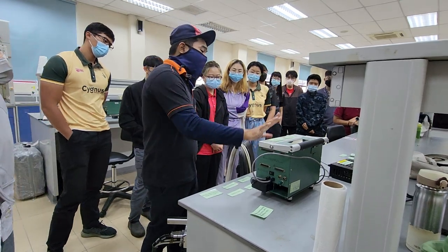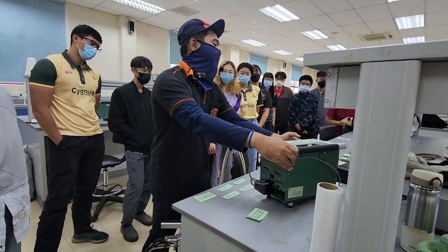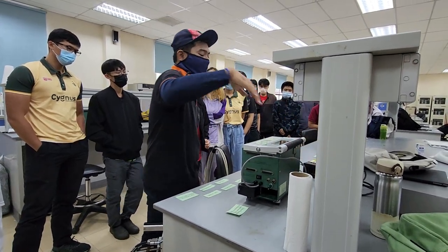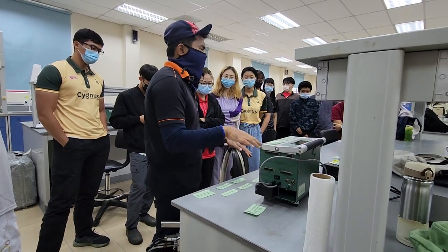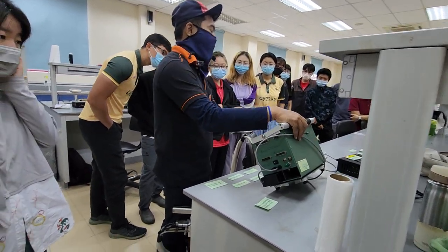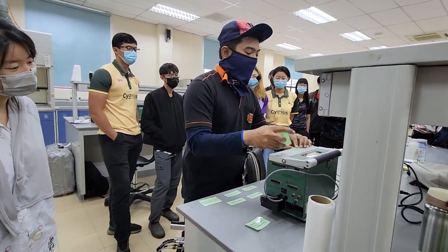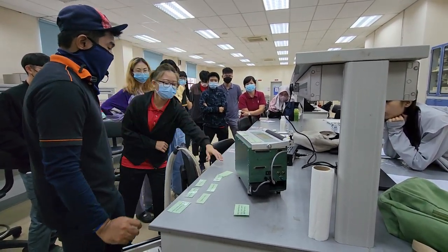This console has faces to it. You got two side faces, this side as well, and also the top side. That's all you need to worry about, because for the newer version, you need to worry about the back side as well. The top side is where you control the machine, pretty much like how you control a computer. You got the little keyboard here and also the monochrome screen, no color, no touch screen. Welcome to 1999.